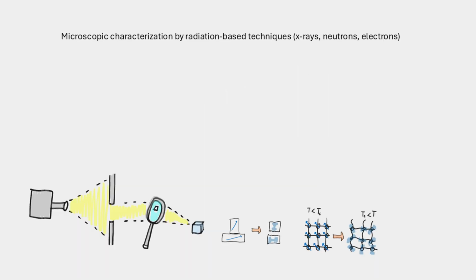My role in the project is concerned with microscopic characterization of thermomagnetic materials. For microscopic characterization of materials, you need microscopical probes. Often this involves techniques based on radiation, such as X-rays, neutrons, and electrons. There are a few reasons why this is handy. The incident beams of radiations can, through filters and optics, be focused into small probes, suitable for small targets.